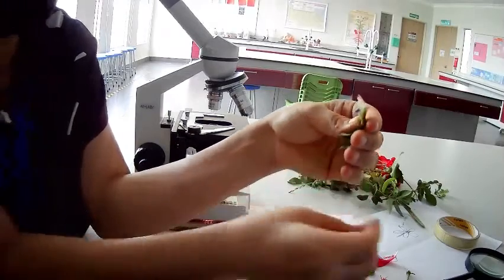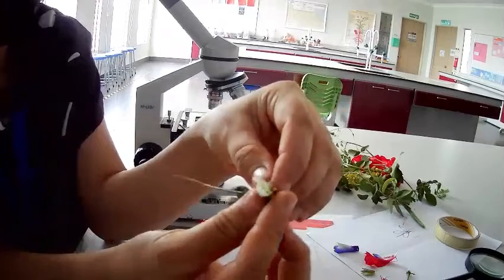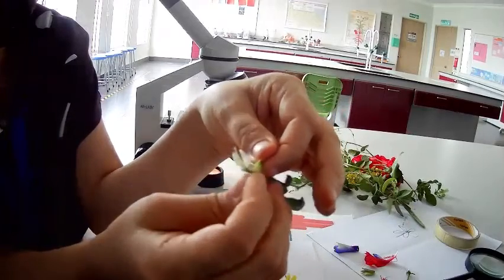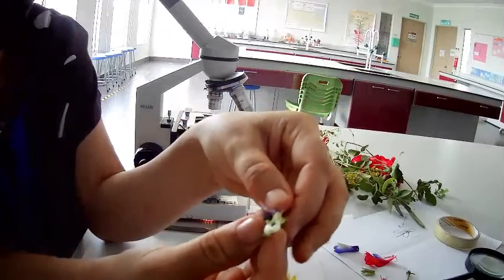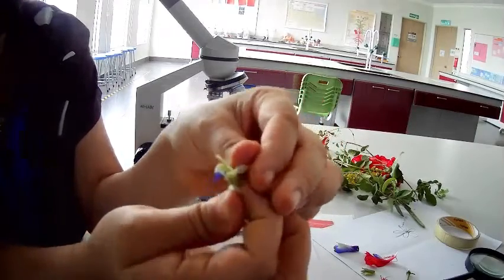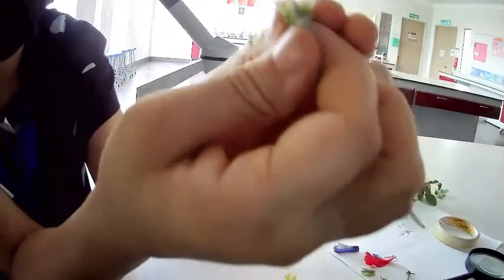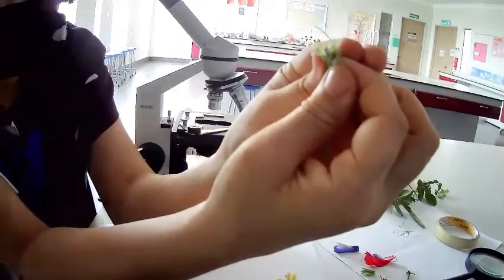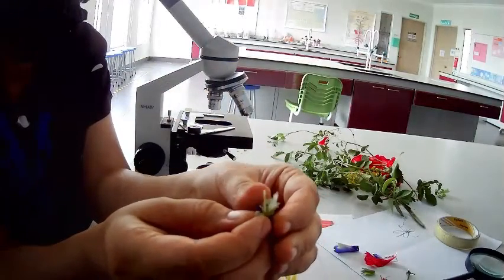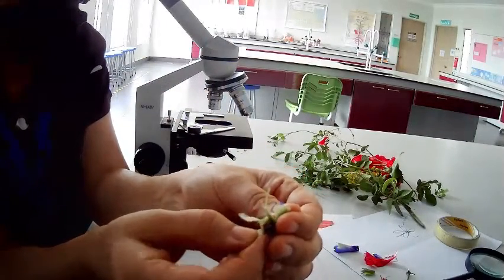I crack it apart and I see male and female organs here. These are the male and female structures. I bring it closer to the camera. I'll try to show this one again under the microscope and show the different parts of it to you.